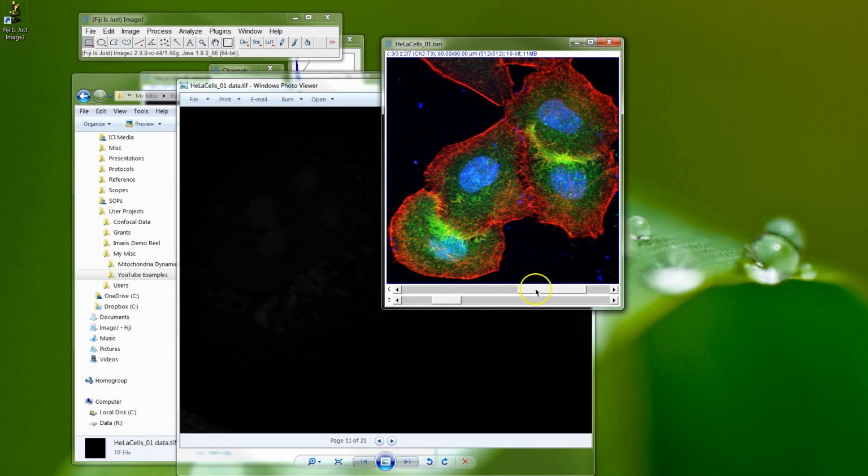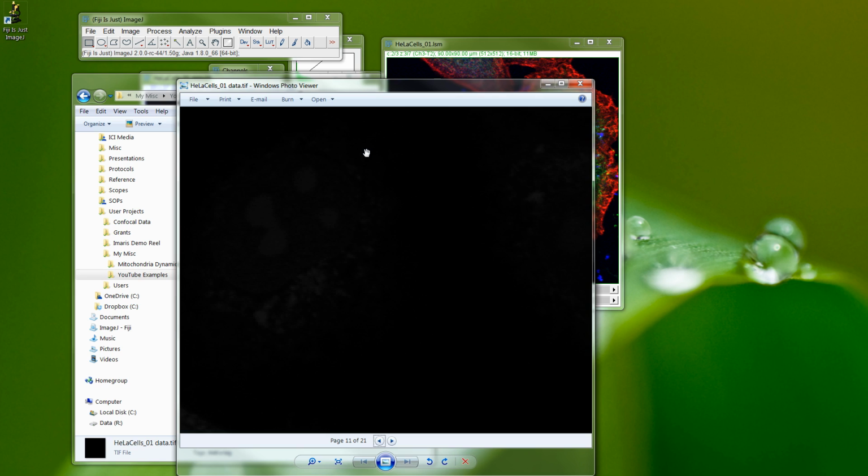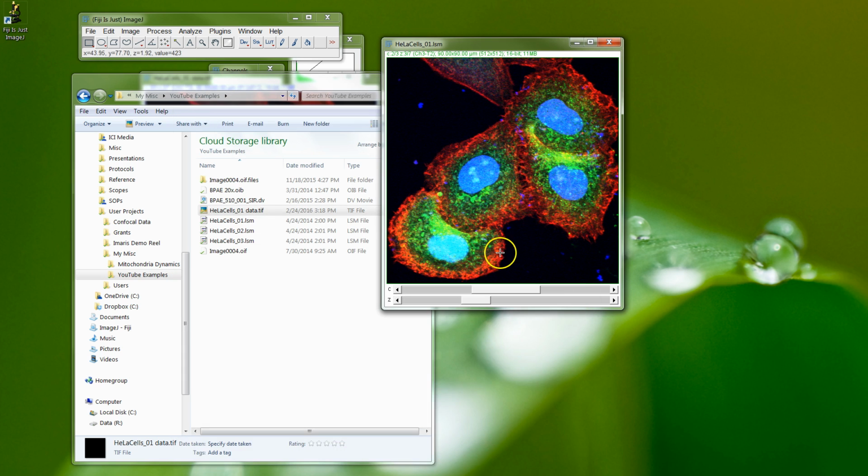The data itself, if I look at the green channel, let's move this slider here and look at this part here, it's a little bit denser, and I look at the number in this main ImageJ window. As I move it around, you can see that I've got some values there which are approaching the maximum. I know there's some in this next level which are maximum, and it goes up to 4095 on the maximum points. I'm having trouble finding them right now, but 4095 is the maximum value for the 12-bit data sets which are commonly used on microscopes. And so Windows and computers will work in factors of 2, so you'll have 8-bit, 16-bit, 32-bit, 64-bit are the numbers you've heard, and so 12-bit is not something that it's used to dealing with, so it tries to scale it to 16-bit, which is 65,000 being the maximum value, and so this image looks a lot dimmer, and all you need to do is just turn up the contrast.